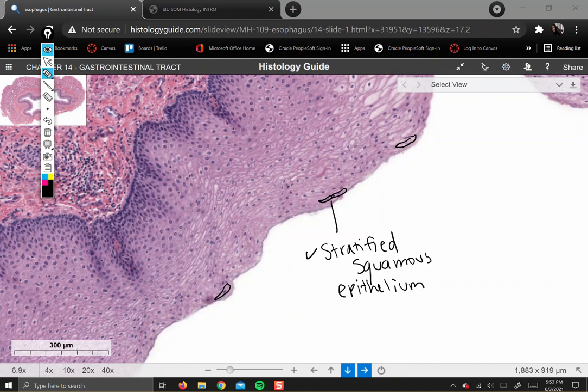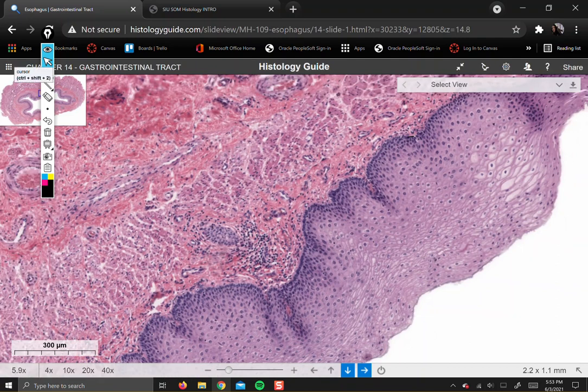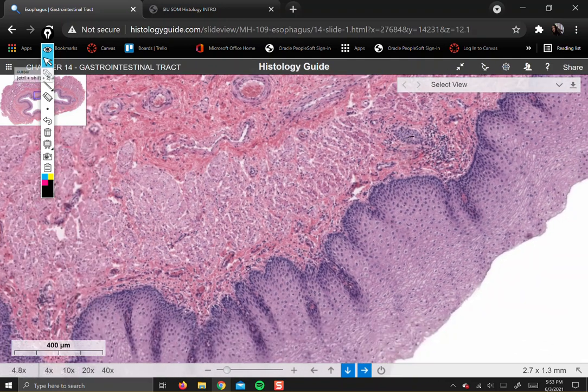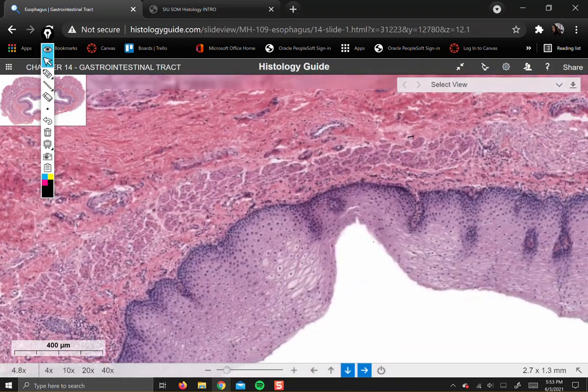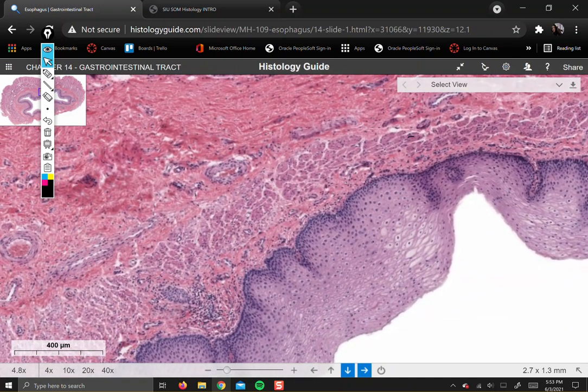So now let's have a look at the other structures I observed. So what we're going to do now is just kind of cruise around the slide and see what there is to see. This behavior, starting zoomed out, making observations, and then cruising around and seeing what there is to see, is perhaps the number one mistake that I see students making, and what I mean by that is not doing that. So watching these videos is awesome.